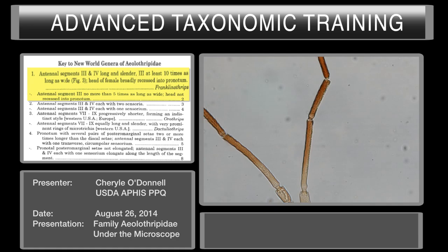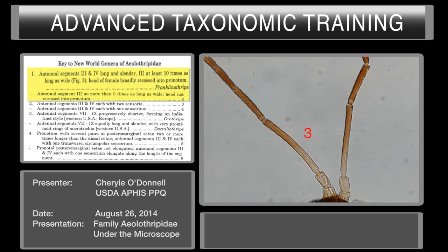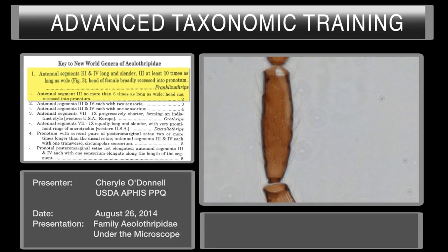This key is from Thrips of Central and South America by Mound and Murillo from 1996. The key starts out with couplet number one for the family Aeolothripidae. We will use the same specimen to key out using this key. Couplet number one requests antennal segments three and four to be longitudinal and slender, with segment three at least ten times as long as it is wide. In this case we happen to fall within that — segment number three is roughly ten times as long as it is wide. That takes us to the genus Franklinothrips.